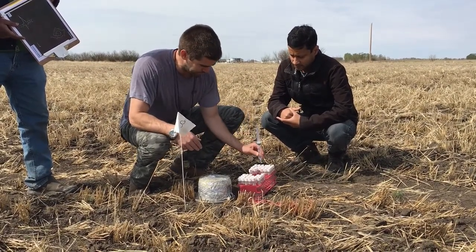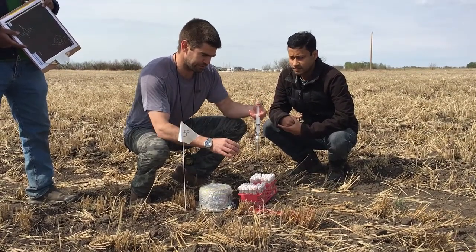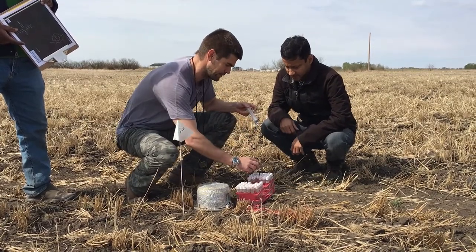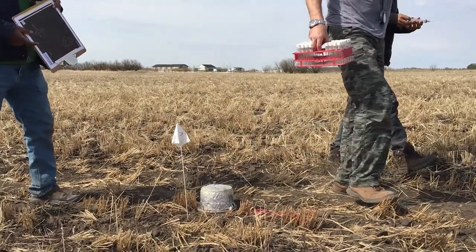There we go — the plunger's going down, that means we have an evacuated tube. I'll give it a flush on the way to the next one.